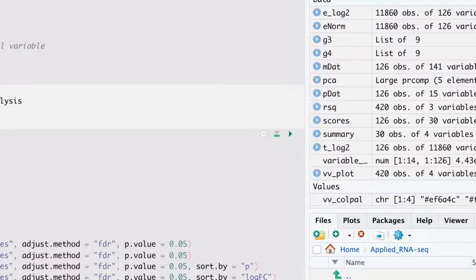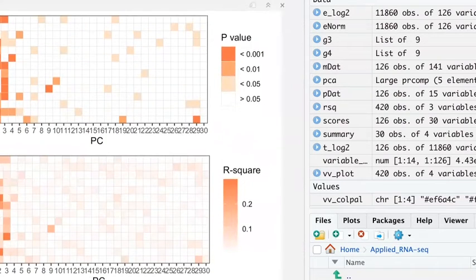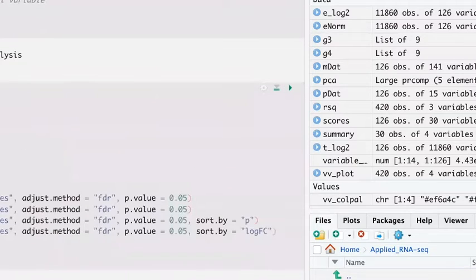So we can't realistically put in all 15, because the more variables you feed into your model, the less reliable it becomes, and it starts overestimating or underestimating the expression contribution of the genes that you see in your data set. So we're going to select some variables that, from our p-value and r-squared analysis, we found to be most significant. We're going to build a model matrix, which is the second step that we do. And then we're going to apply Bayesian statistics.